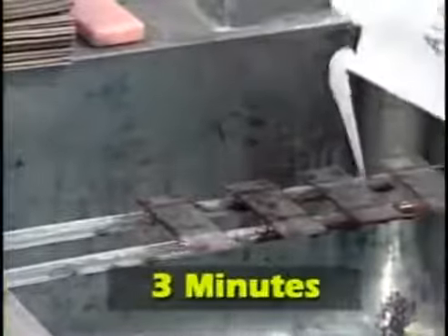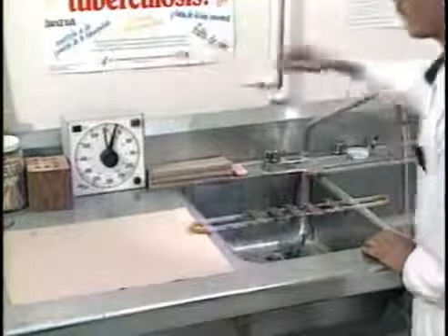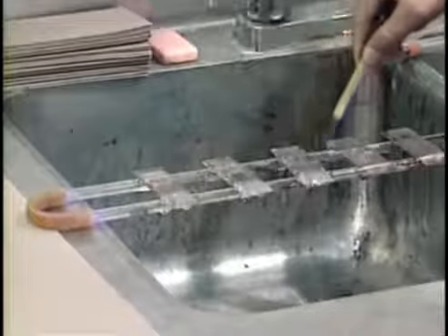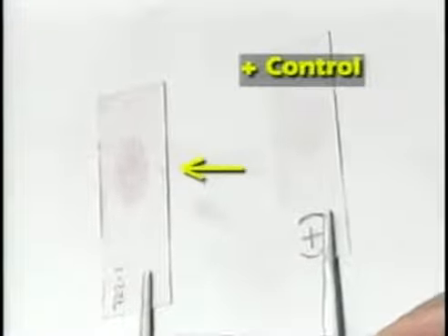Cover each slide with decolorizing solution such as acid alcohol. Leave this on the slides for 3 minutes. If under-decolorized, sputum contents other than the TB bacilli may remain stained. This could lead to a false positive result. Rinse slides again carefully with water and tilt each slide to remove excess water. If the slide is still pink, an additional amount of decolorizing solution can be reapplied for 1 to 3 minutes.